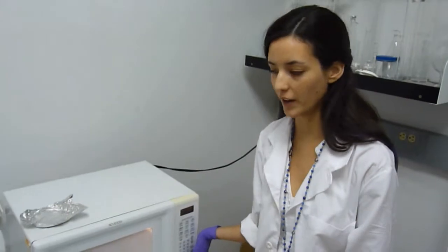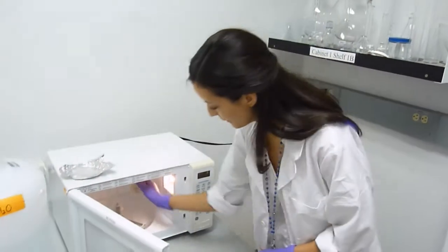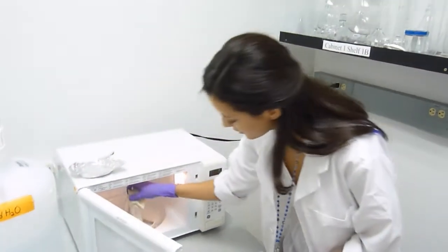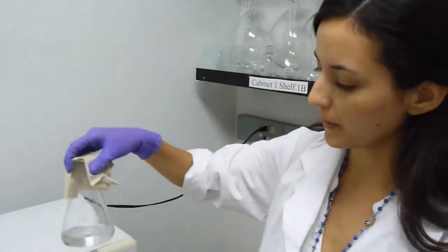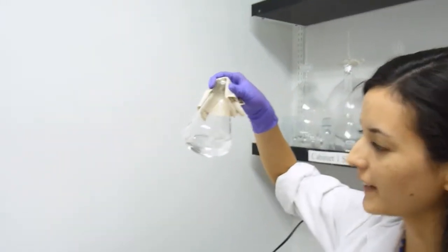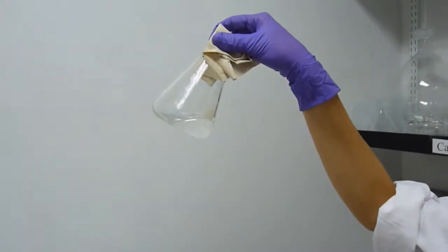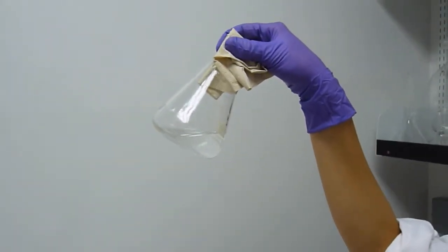After the first round of heating, we're going to check if our agarose has melted. We're going to take it, swirl it a little bit, and check if it's fully melted. I can still see some particles that have not fully dissolved, so I'm going to heat it for another 30 seconds.